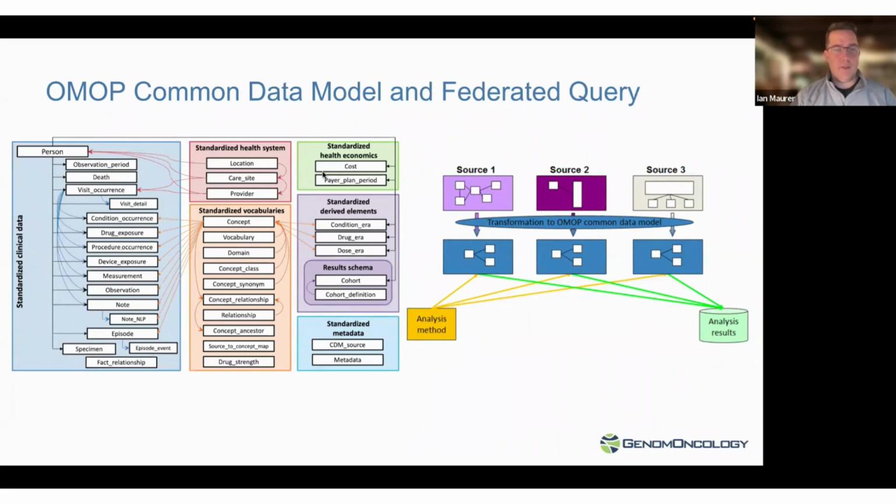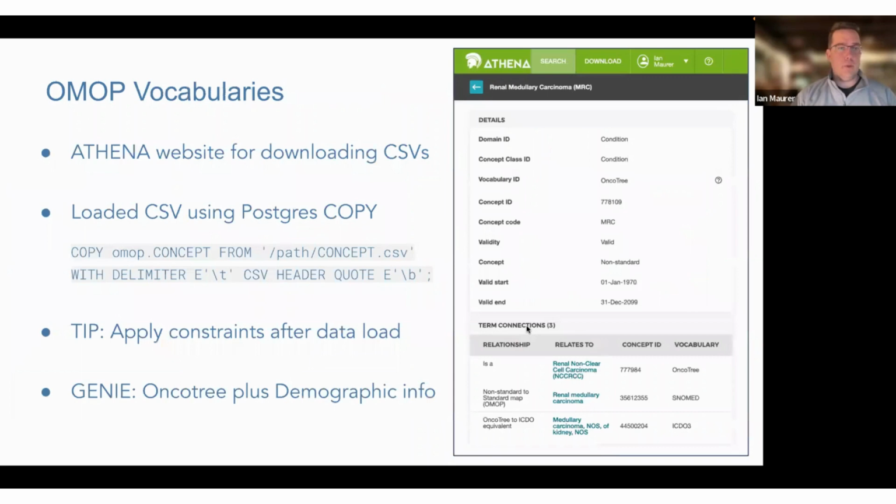And it basically provides database tables and schemas, and it does a really great job at clinical data, standardizing all the information to standard vocabularies. Then they build tools on top of that to allow querying, shared querying across patient records. There's a tool called Athena for navigating their vocabularies, the concepts.